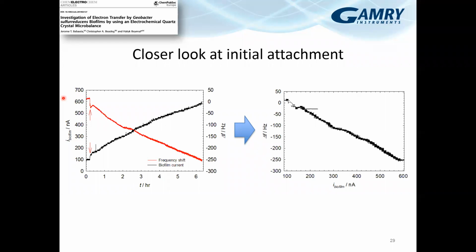Hello, everyone. You say that acetate is the source of the carbon. Why only acetate? I'm asking if any other source can be used. Any other carbon source can be used for different strains or different microbes. In this case, it is simply known that Geobacter will use acetate as an electron donor. It can also produce electrons by turning over hydrogen and maybe other secondary metabolites, but in the literature, most of the systems feed Geobacter with acetate.